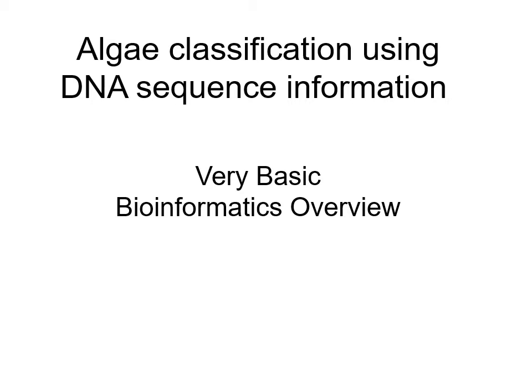So we weren't looking for the RNA, we were looking for the DNA that codes for the RNA that ultimately becomes a subunit of the ribosome. And that's the 18S subunit of the ribosome. So we PCR'd that fragment and we created billions of copies of the 18S ribosomal RNA gene. Then we took those copies and we sent that out for sequencing by the Sanger sequencing method.